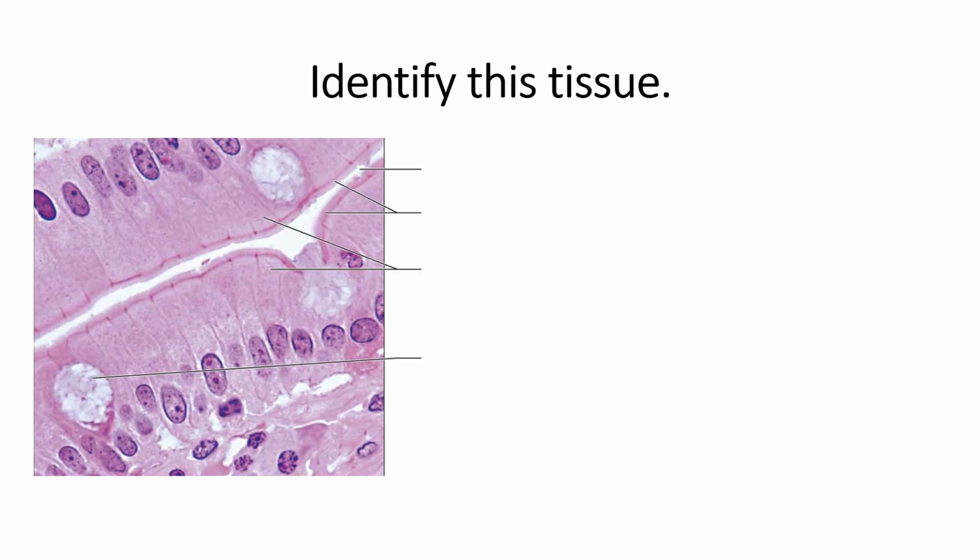All right. So a quick practice, just a few slides of helping you look at images of tissue and try to figure out what it is you're looking at, right? Where to even start with that. So starting with this first one, right? It may or may not be easy, but I'm going to show you how you can make it easy, even if it's not obviously easy right out of the gate.